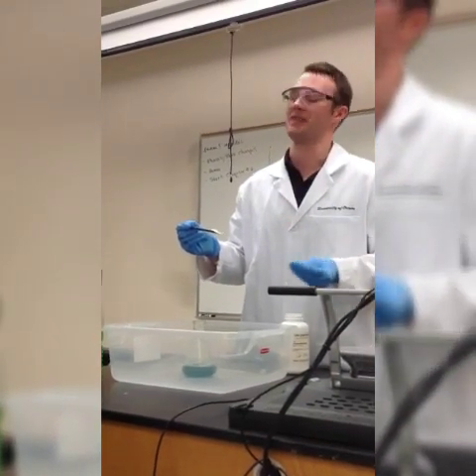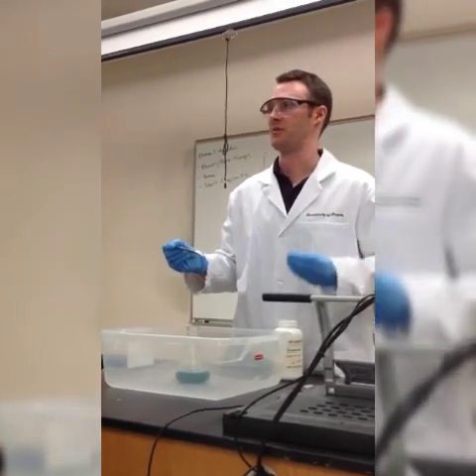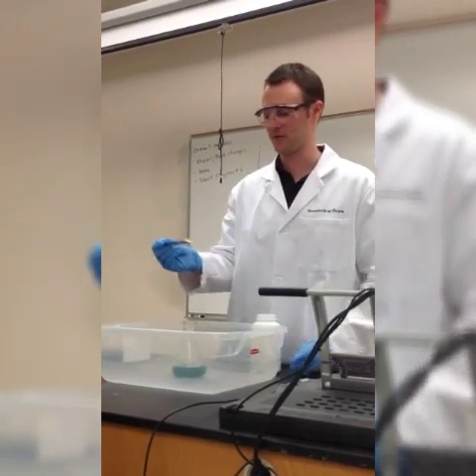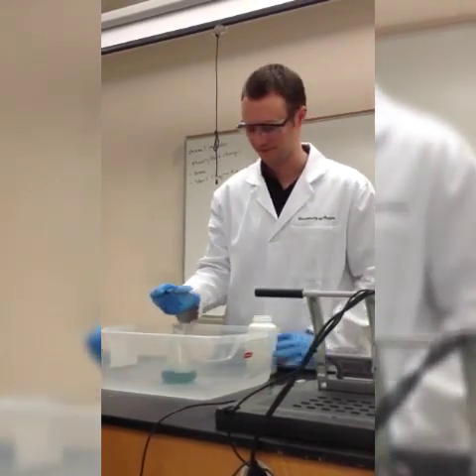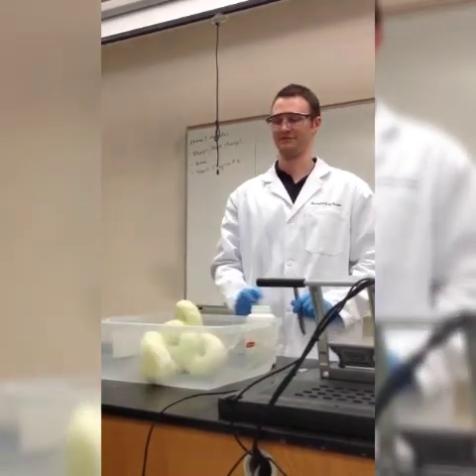And so what we want to see is, do we see any observable change here? Do we see a coloration form? Do we see our oxygen form and whatnot? So we go ahead and add this stuff. So we'll see. Yeah, that's enough.